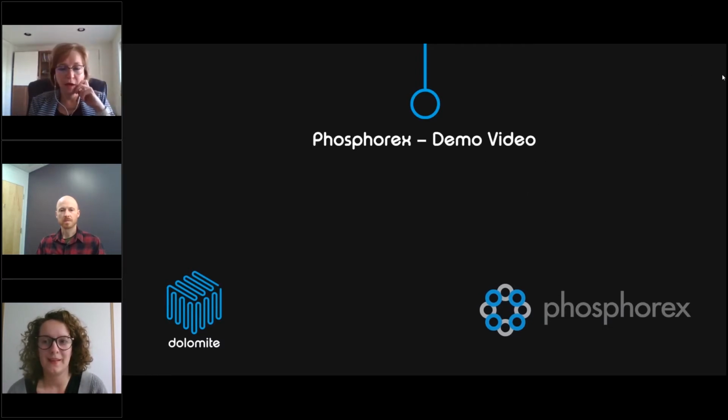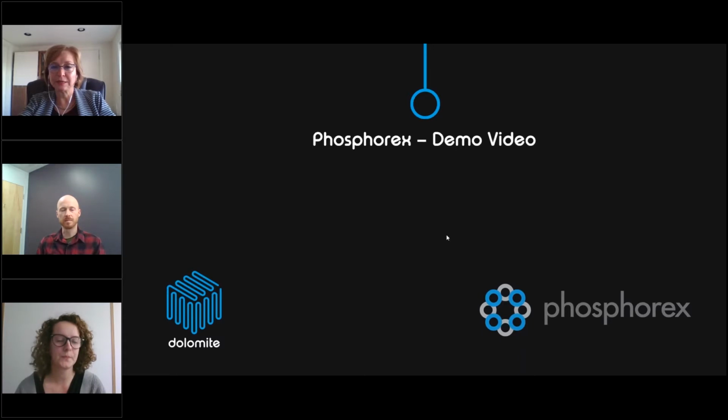Kate, thank you. Thank you very much. So I think that there's some questions coming, and I would like to ask you just one really quick question. Sure. I think it's a quick question. I think it would be helpful before the demo to talk about this. Can you use other microfluidic geometry with the AMP system?